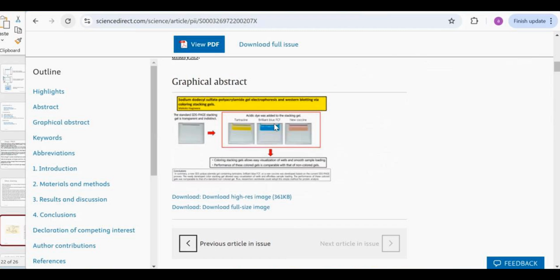Because post-translational modification, that is once the protein is formed, further maybe carbohydrates are added, glycosylation may be there. So there is a change in the molecular sizes, and so the band forms are going to vary. Of course, HIV testing and all, where you have the basis for detection of viruses, different proteins from the viruses can be analyzed. Western blotting and protein ubiquitination, that is another application when it comes to SDS-PAGE.